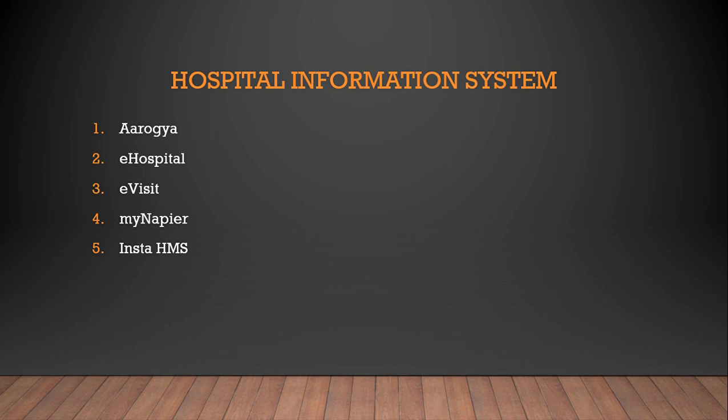The main idea is just to put the test with respect to the patient, get the reports from the instrument to the system, and it can be printed and saved as part of the medical records. That's the main difference between a hospital information system and a laboratory information system.